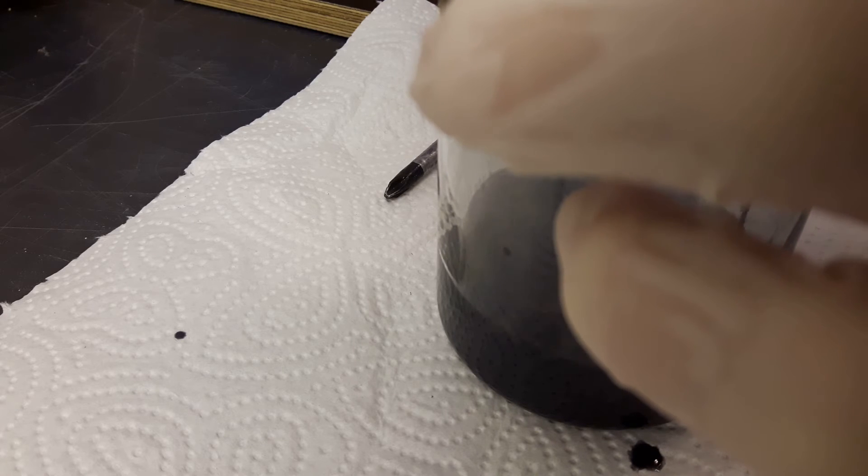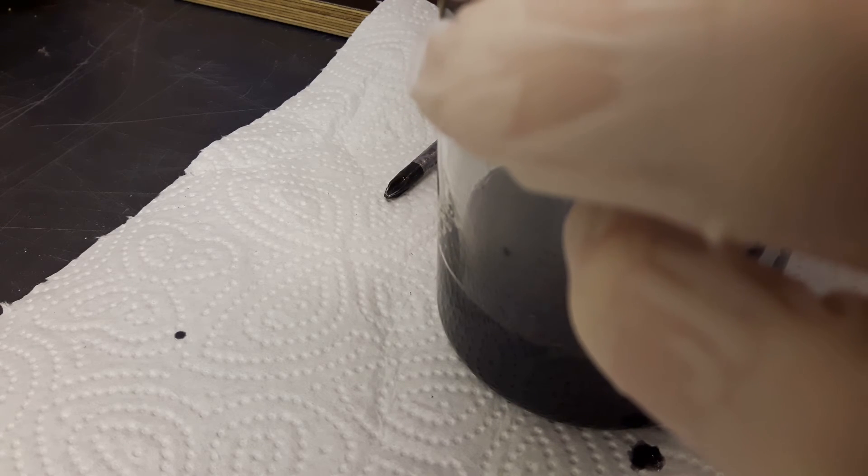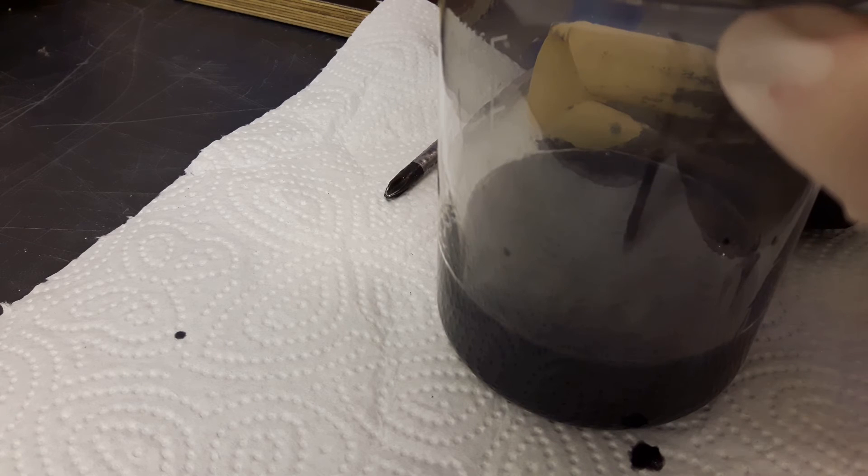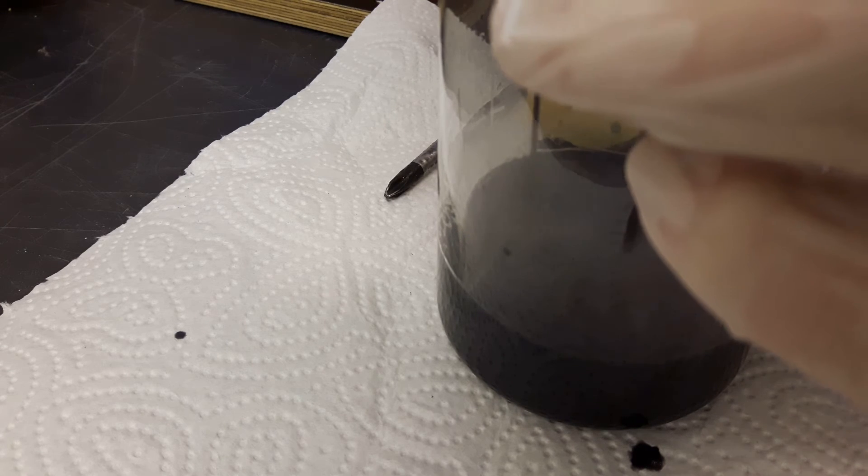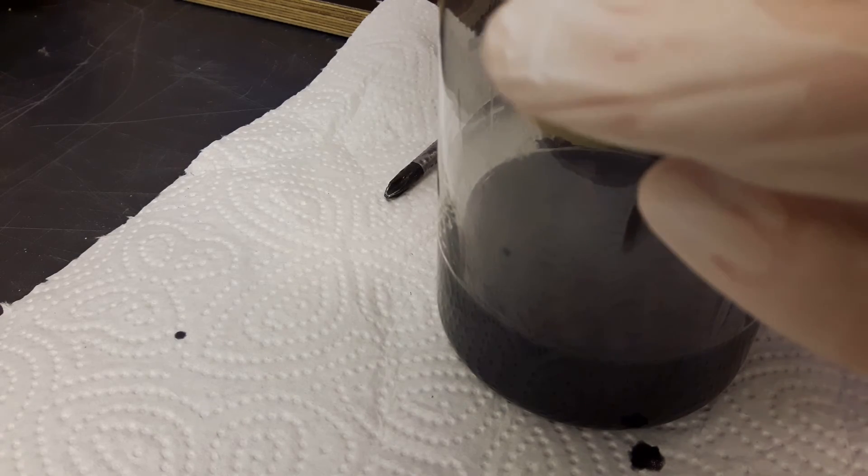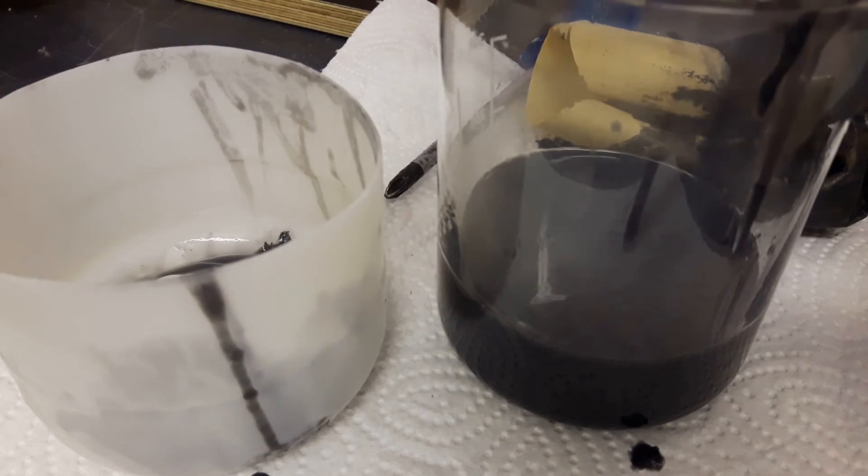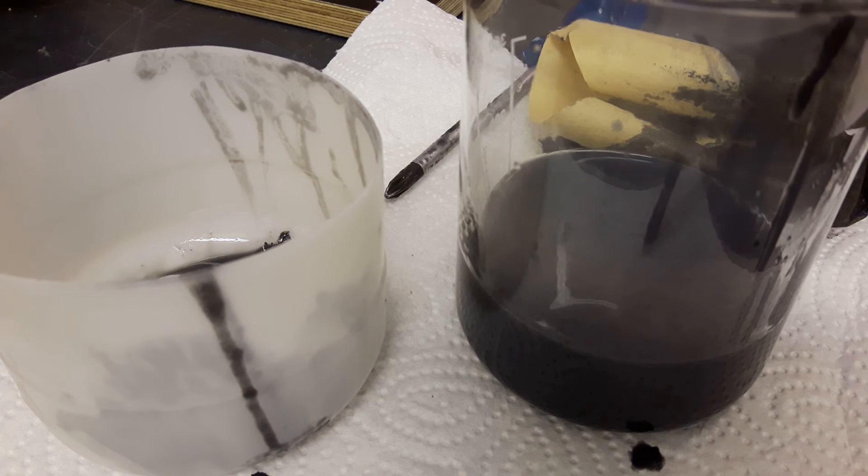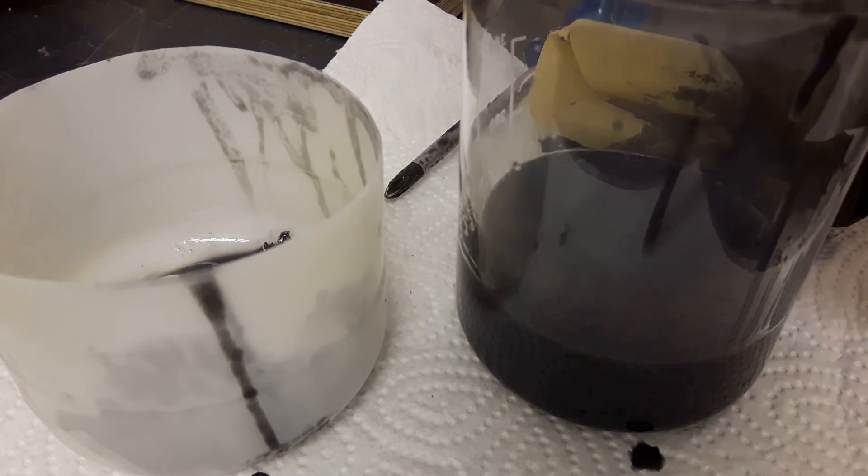So finally I just poured the content of the beaker back into the earlier Erlenmeyer flask for the distillation. So swapping the beaker or flask is absolutely unnecessary and just part of the fail here. As you see this stuff makes a lot of dirt and it's stinking horrible. So make sure that you have a good ventilation.